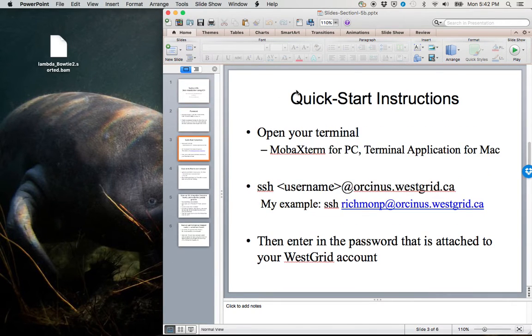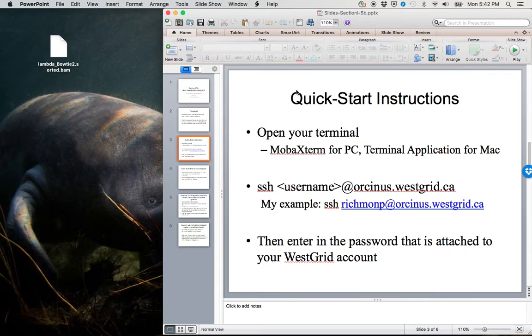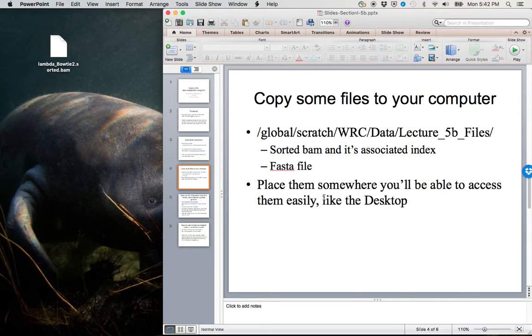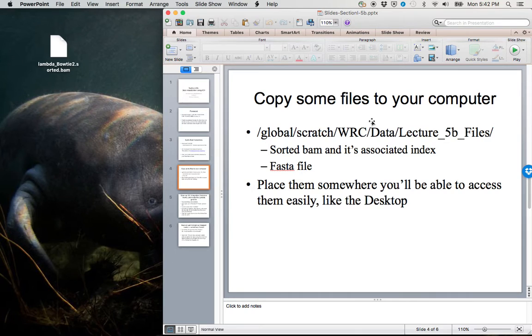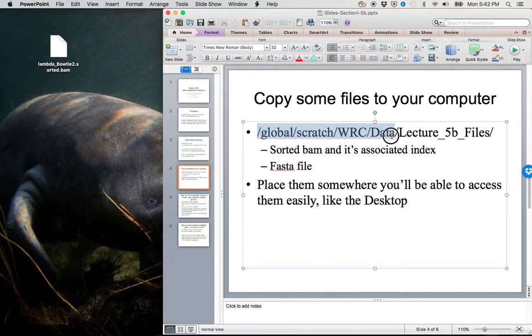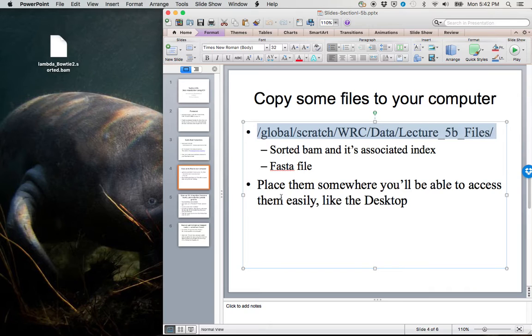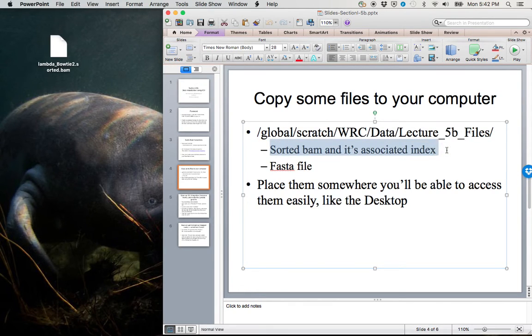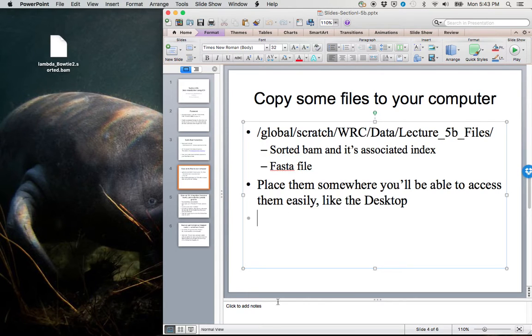Some quick start instructions. We actually won't need to use the terminal unless you want to use it for SCP. Within this session, I'm going to use CyberDuck, my file transfer client, in order to transfer between the WestGrid server and my local machine. Either way, what you need to do is copy all of the files from this directory onto your local machine. The things that we need really are the sorted BAM and its associated index and the FASTA file.